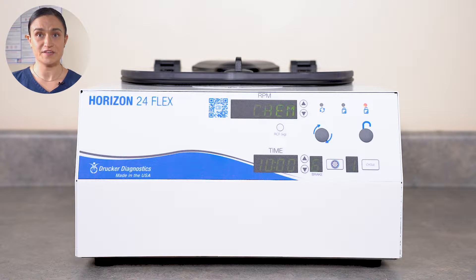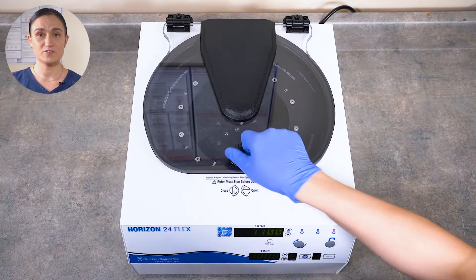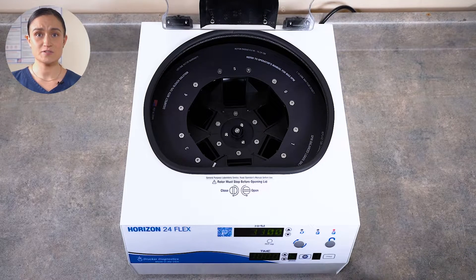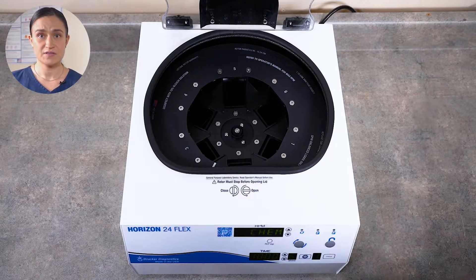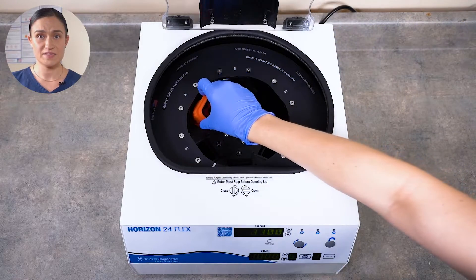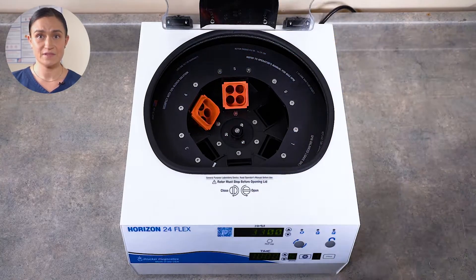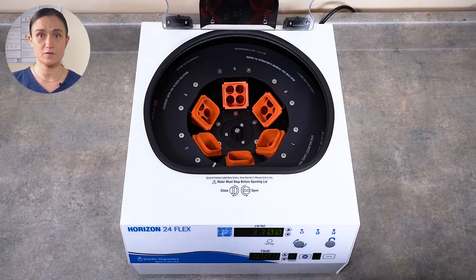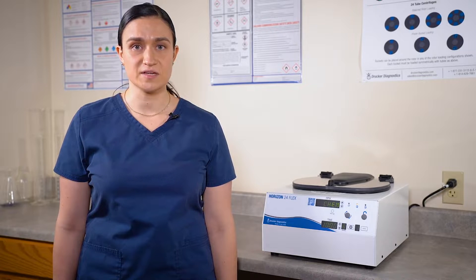If you'd like a more in-depth overview of these controls, a link to a full overview video is on your screen. Now we can twist our lid latch and lift the lid open. You can see our rotor inside. Your Horizon 24-Flex comes with its rotor installed and ready to run. All we need to do is place our tube holders. You can see the slots all around the rotor — simply place one tube holder in each.